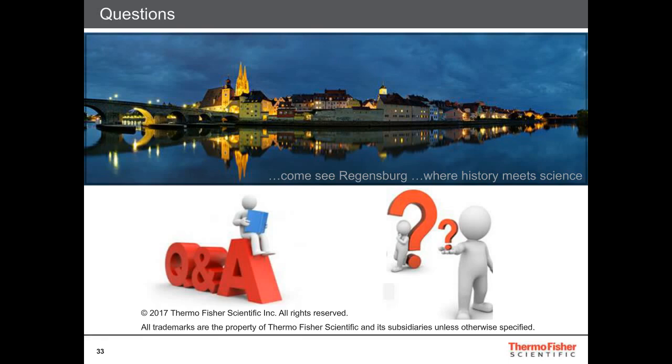So usually how we set up our projects is as milestone projects. For example, if you have a completely unknown protein which has never been produced before, we would start with a small-scale expression, which we call an expression proof, basically to determine: is your protein expressing, how is it expressing, in order to determine the best harvest day, is the protein secreted, is it cellular, where we have to purify it from.